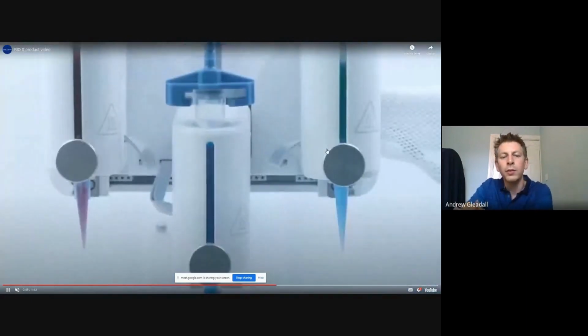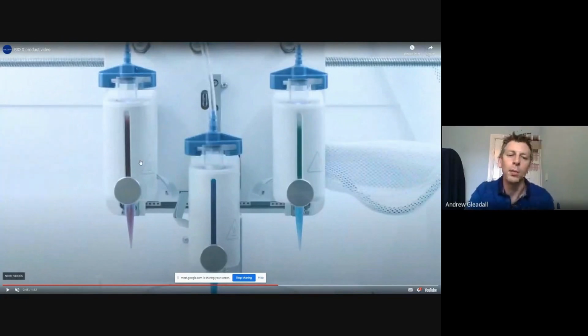So you saw the print heads, one moved up, one moved down, and that's just a logical benefit so that the previous print head isn't crashing into the structure as you're printing. It's not always required. You can have printers where the multiple print heads are all constantly at the same height, and you just have to try to avoid putting the print heads at the side into the structure if at all possible. If you're printing in well plates, that would become really challenging. But on a typical structure where you're printing layer by layer, all your nozzles should be just slightly above the structure that you're printing anyway, by one layer. So it is possible.